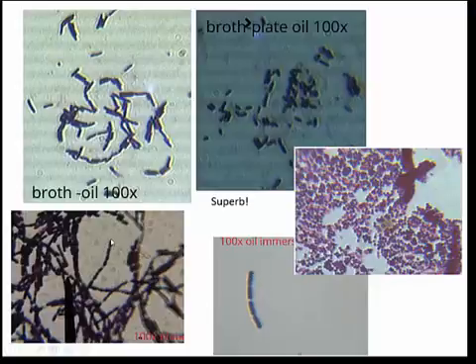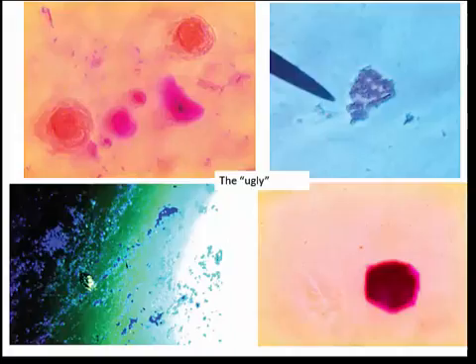And this is wonderful as well. This is a streptobacillus. And so we see a cell, a cell, a cell. This looks like it might be a cell that's dividing into two, or right there. So these are chains of bacillus. Okay, so that would be streptobacillus. So these are all just wonderful images. These are the types of images that you're shooting for.